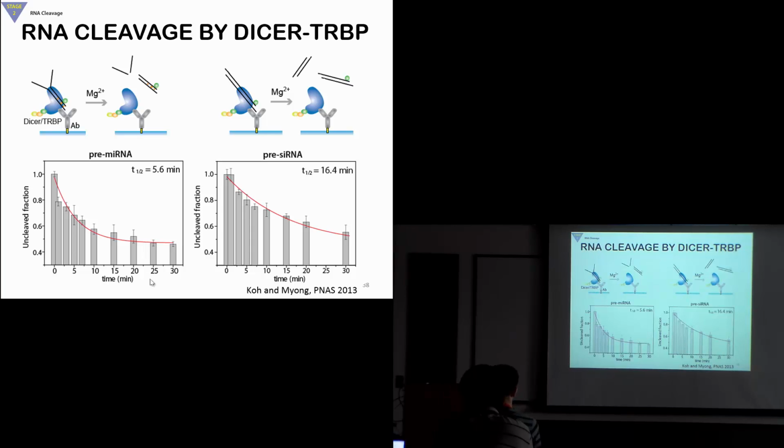It's thought to be oxidative damage on the molecule. So Cy5, if I talked to you about the 2 rings interconnected, has a much longer interconnection. So in isomerization, maybe it has more chance of going into the dark state or these states.